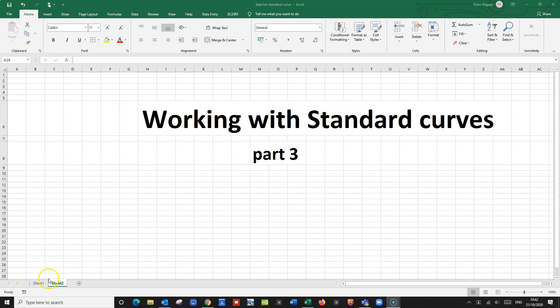So now let's create our standard curve. This is the third part of working with standard curves, and for this I am going to use Microsoft Excel because it has all the features that we really need.